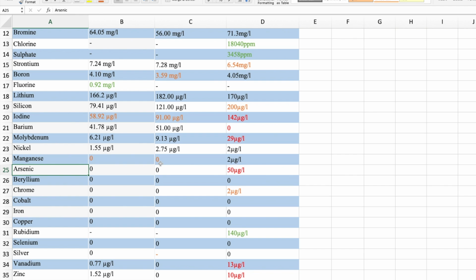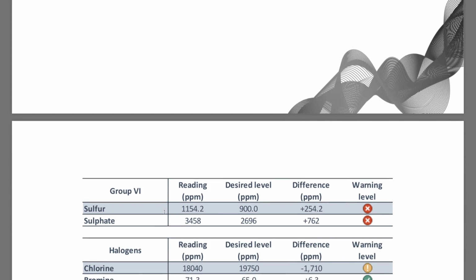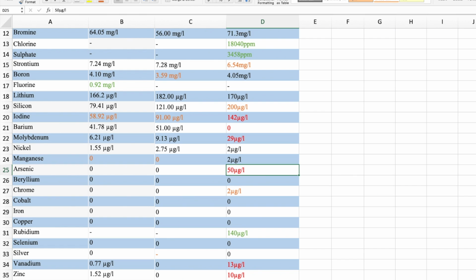Onto arsenic, which is a strange element. Both ATI and Triton didn't detect it at all, where Quantum found 50 µg/L, which is quite a high value, significantly over the set point. Let me have a look at what the set point for arsenic is. The desired level is not detected, and I had 0.050 ppm, which is quite high, particularly when the other two tests found it not detected. So I'm going to question that. I mean, it could be contamination, but that's a bit left field.